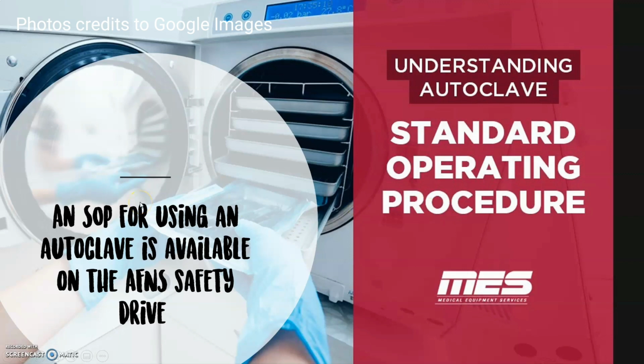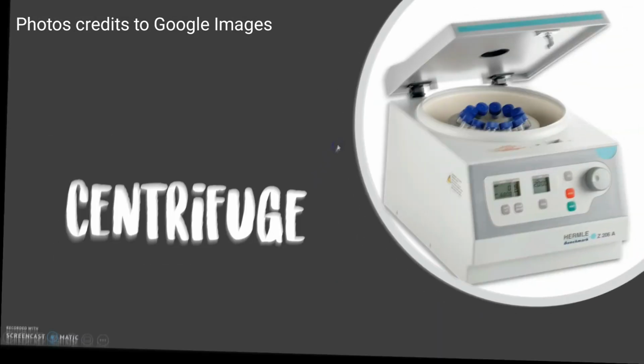An SOP for using an autoclave is available on the AFNS Safety Drive. So, for understanding the autoclave, there is a standard operating procedure.